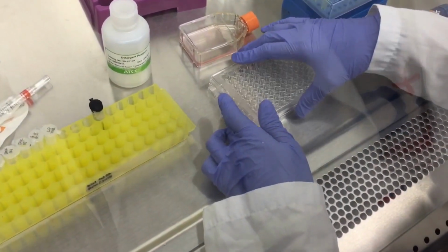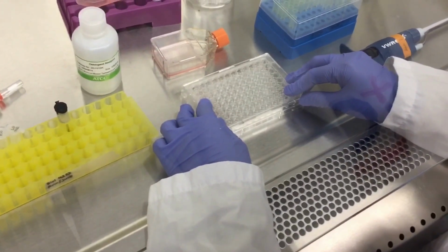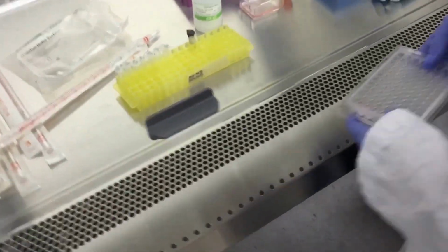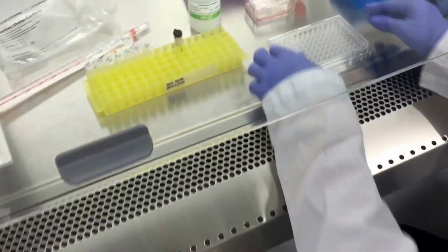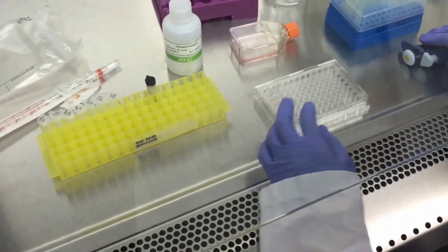Okay, after you're done placing in your cells, media, and compounds, you're going to place your 96 well plate into the incubator. And after 2 days, you add MTT. We're going to add 10 microliters of the MTT.